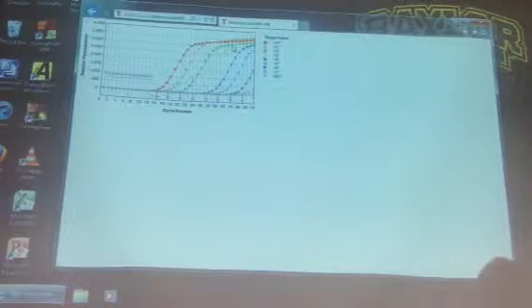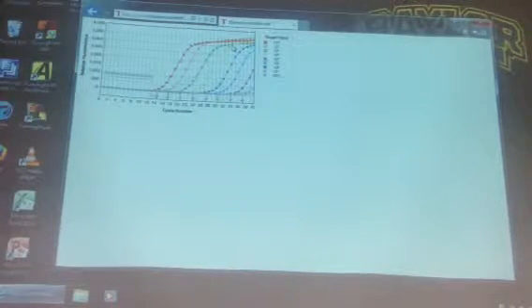Okay. All right. So with qPCR, we're going to measure this amount. You can see here that the target input, the one in red, is 10 to the 8th mRNA molecules. This one, in orange, is 10 to the 7th, then 10 to the 6th, 10 to the 5th, 10 to the 4th, 10 to the 3rd, and then just 100, and then 10 right here, and then no molecules at all. And you can see the cycle number here, and then we're going to call this right here. This is where we're going to do our reads.